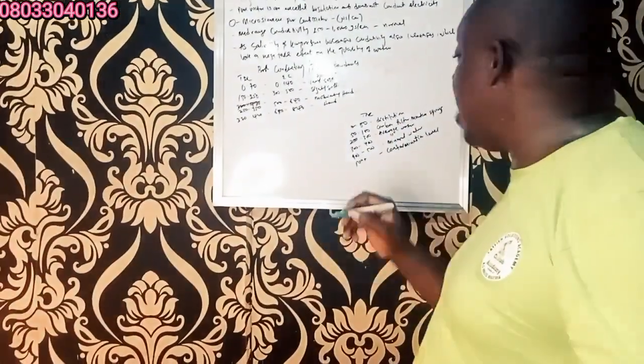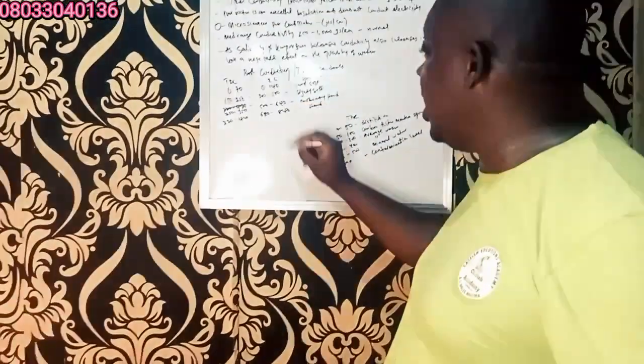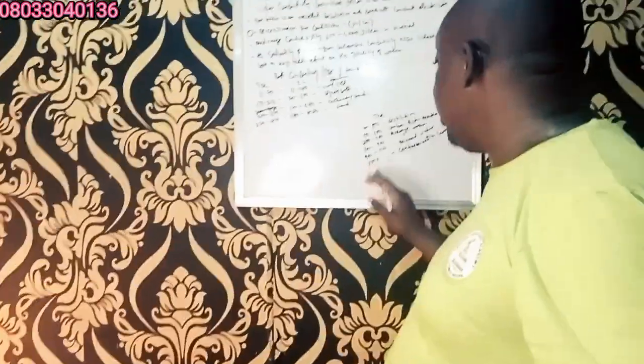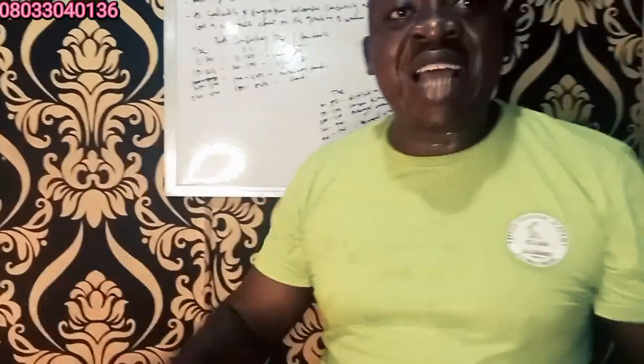But for 400 to 500, you have what we call the mineral water. The mineral water, by the time you check it here, it tells you it's moderately high. That means the hardness is high and the total solids is high. And now we go to 500 plus. That means you have a contaminated level of water. Your water is highly contaminated. So from this, I'll be rounding up.